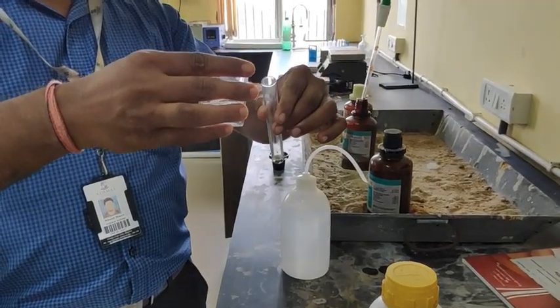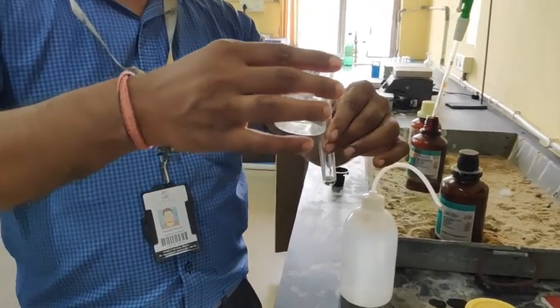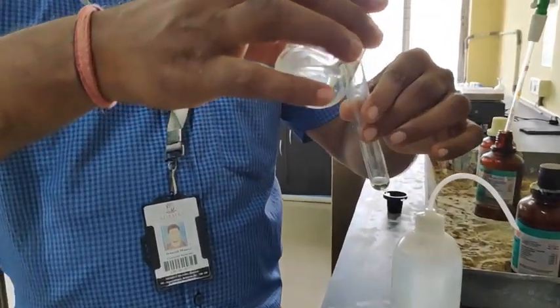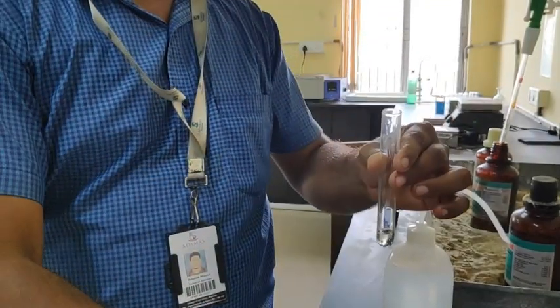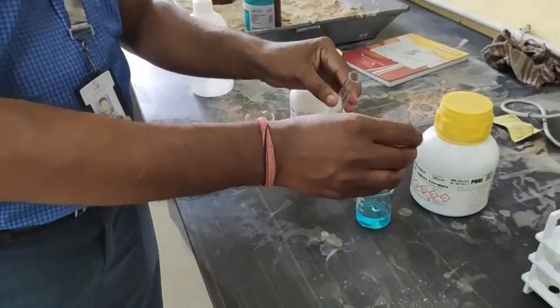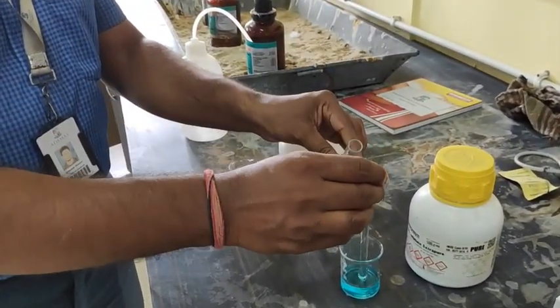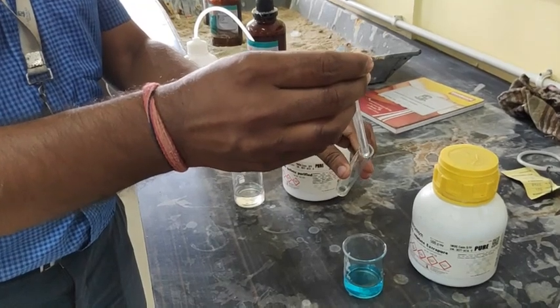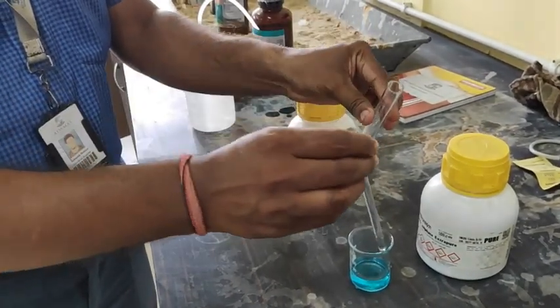Now he is adding the sodium hydroxide solution. Please add the sodium hydroxide solution. Okay, some sodium hydroxide solution has been added now, and some copper sulfate solution is now being added dropwise.